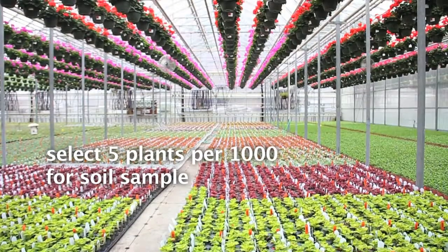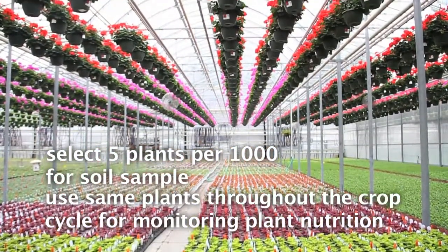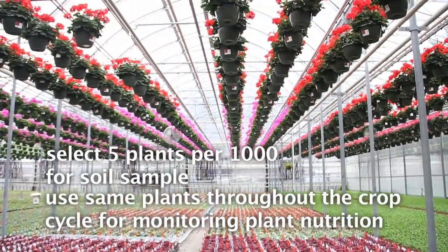The way that we do this is we select five plants out of a thousand — a minimum of five — and these would be the plants that you're going to continue to use throughout the growing season if you're going to do monitoring.